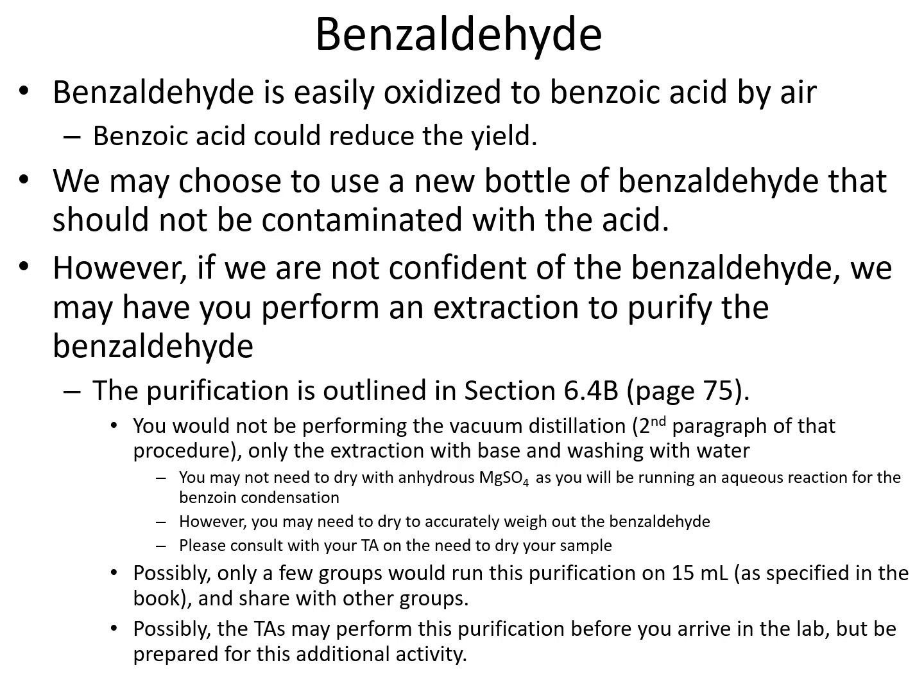But we need benzaldehyde as pure as possible, because it may affect our yield in the end. If the benzaldehyde we use here is contaminated, then we will have a very small yield in the end. So how benzaldehyde is purified is all described in the second experiment in this course.